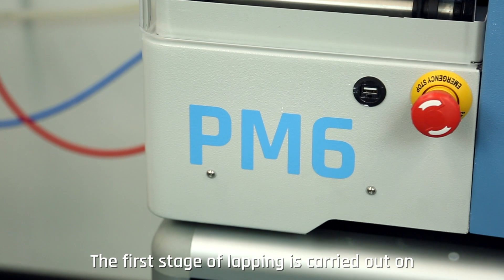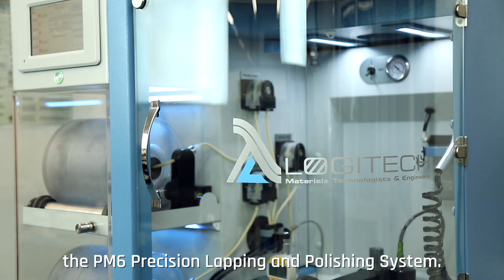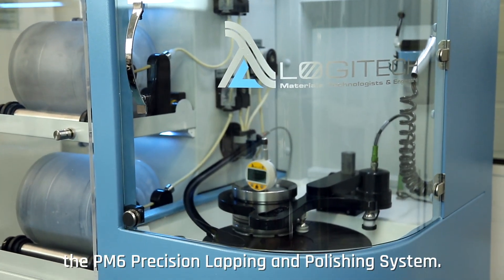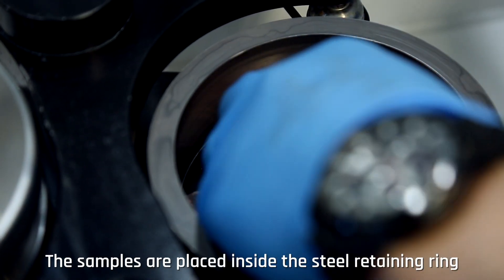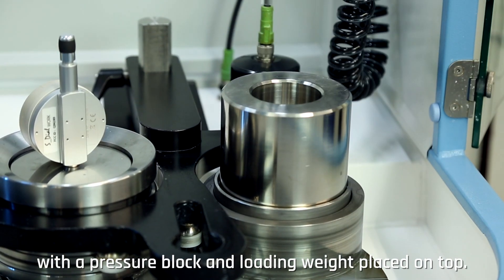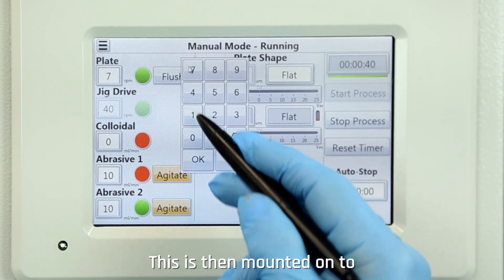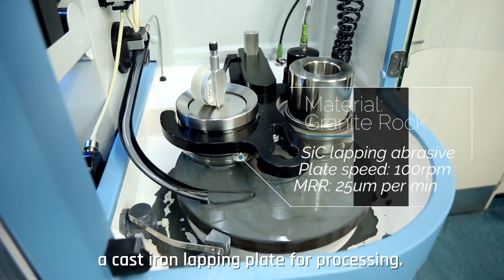The first stage of lapping is carried out on the PM6 Precision Lapping and Polishing System. The samples are placed inside the steel retaining ring with a pressure block and loading weight placed on top. This is then mounted onto a cast iron lapping plate for processing.